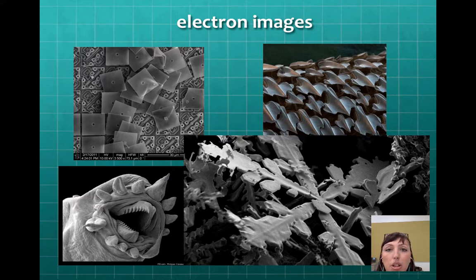Here are some images created by electron microscopes.